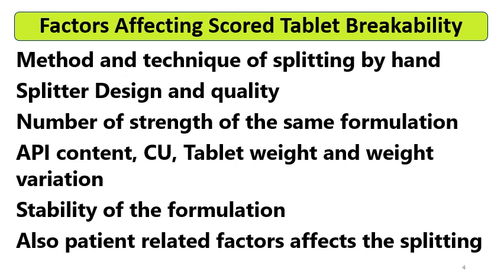Stability of the formulation. The intrinsic stability of the formulation, whether the tablet is coated or uncoated, is required to be evaluated at R&D scale. Based on that, the formulation composition and manufacturing process should be finalized.